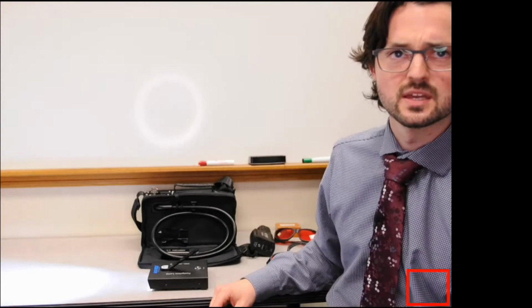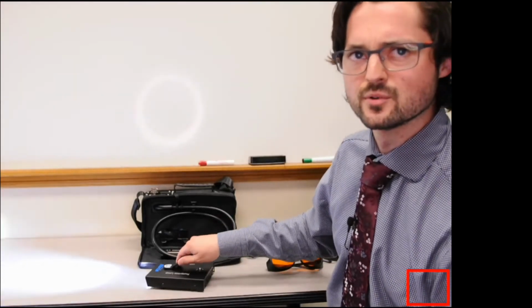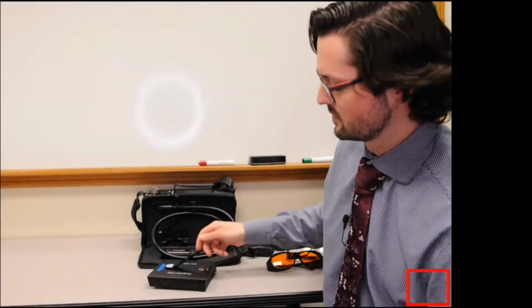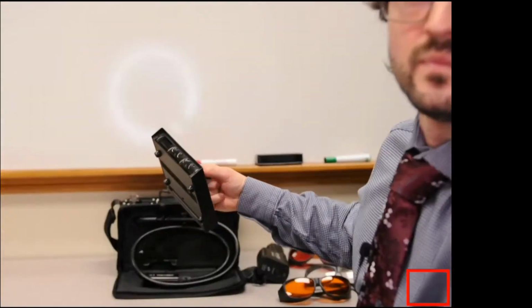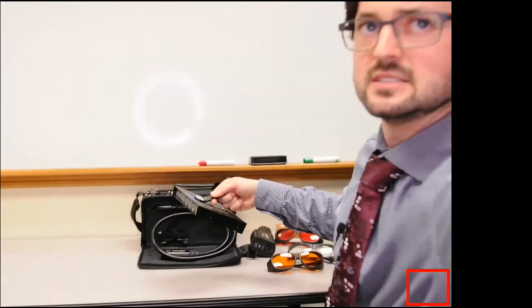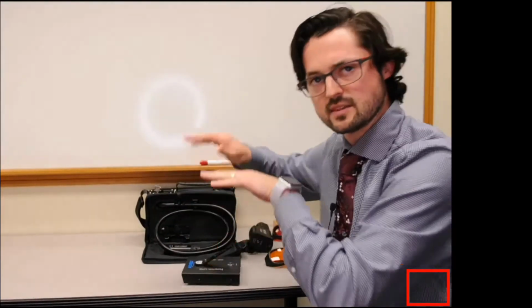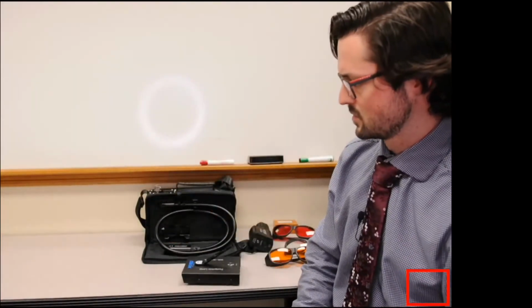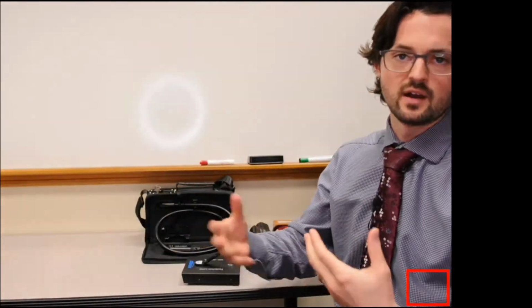And I don't know if it's picking it up. It might be a little overexposed, but it really picks out anything. It's got this big lens on the front of it where you can see the LED array actually behind it. And what that does is it really allows you to get that very light skimming right over the surface, which is essential if you're trying to pick up footwear or tires.